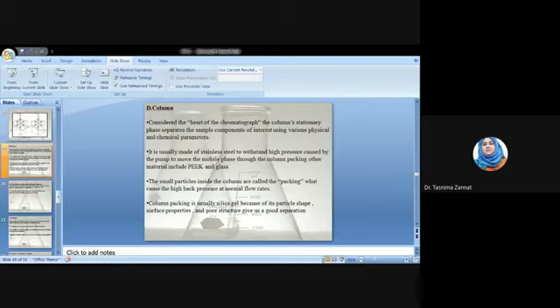And what is the role of the column? Actually, in column there are a lot of plates, and this column may be steel made or maybe glass made, and the small particles inside the column which are called the packing materials. These are actually the adsorbent. Packing materials actually the adsorbent.